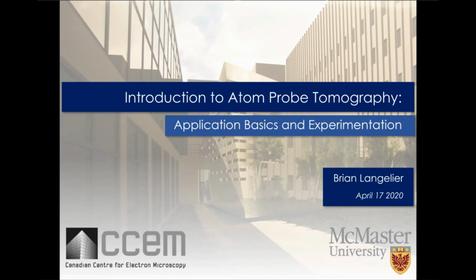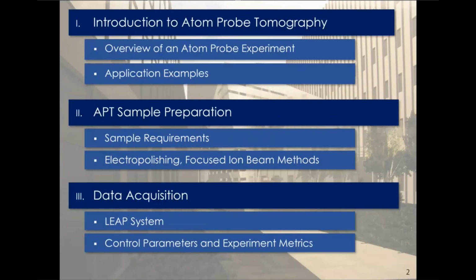So overall for this talk, I'd like first to introduce the technique, define what atom probe is, and give a few application examples. And then the two main aspects of the atom probe experiment that I'd like to focus on are atom probe sample preparation and data acquisition. Those who know about atom probe know there's a little bit more to a total atom probe experiment than that, but we'll be leaving those topics for a future date.